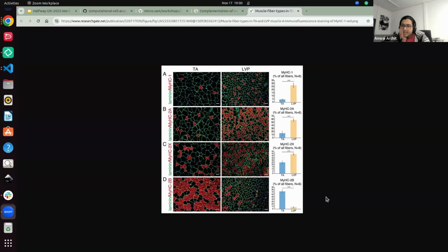Do you think it needs much computer power for that? I am guessing you mean just the annotation part, not the retraining part. Do you mean just the segmentation and annotation? For this one, you do not need much. I'm again assuming these are 2D images. If they are multiplex, high res images, they should take a couple of minutes to run the first step of computing embeddings. But once you've done this only once, you can rerun it and keep on annotating. So it shouldn't take more than a couple of minutes, optimistically speaking.